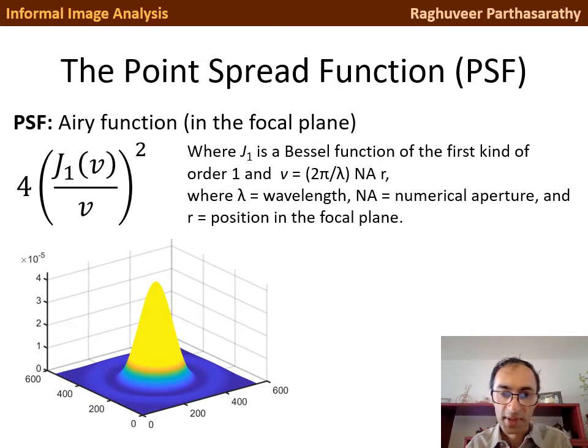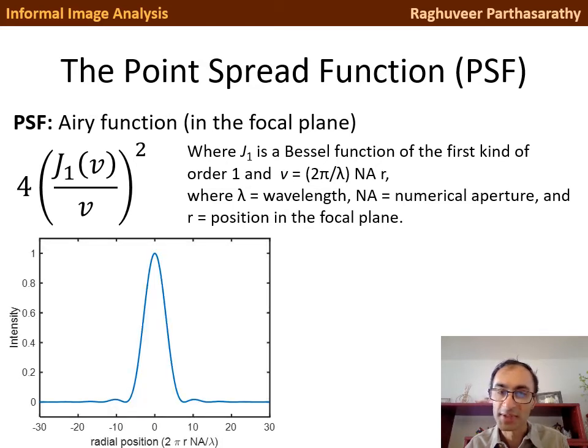So this function, what it looks like, indicated as a surface plot, is here. We have this sort of spread out couple hundred nanometer wide spot. If you look carefully, it doesn't just decay monotonically to 0, but there's actually little wiggles and oscillations, which you can often see in the actual images of a crisp object in a microscope. So here's our theoretical expression for the point spread function.